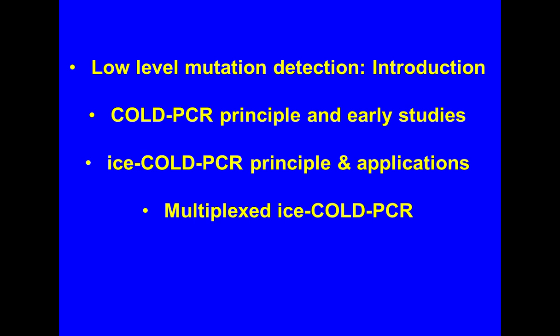We will talk briefly about the significance of detecting low-level mutations, which is what COLD-PCR does, and go over the COLD-PCR principles and early studies, as well as the most advanced version of the technology called Improved and Complete Enrichment, ICE COLD-PCR, its principles and applications, as well as multiplexed ICE COLD-PCR.